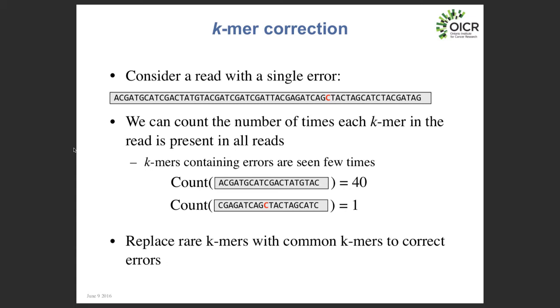And the k-mer is based on breaking up what you see in a read. Yeah, exactly. So let's take just five-mers here. The first five-mer of our read is A, C, G, A, T. The second five-mer is C, G, A, T, G. So we're just going to slide that five base pair window across our entire sequence and insert those into the hash table. And so how are errors then?